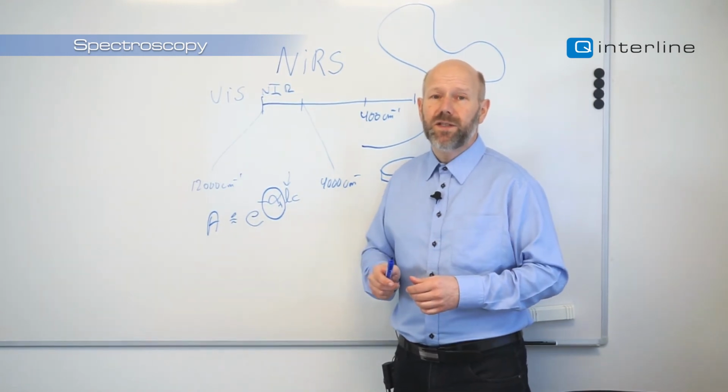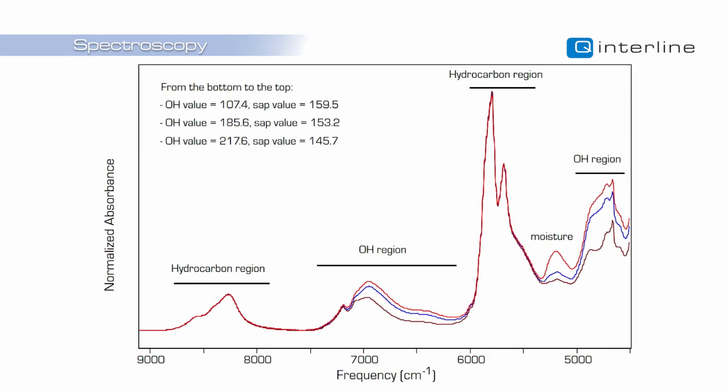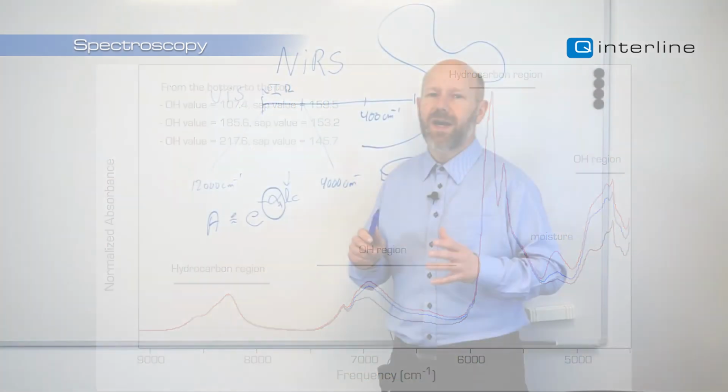Zooming in on the near-infrared region, we have some major regions. In the fingerprint region, which is a word we do not use in the near-infrared, but still it's the longer wavelength region, we have a lot of details. It's still an OH region, a region of many, many different things. And then we have CH, OH regions throughout the spectrum. And we need to pay more attention to small shoulders, shapes of these peaks rather than individual peaks, because everything is smeared a little bit into larger, broader peaks, and we have to resolve that with mathematics.